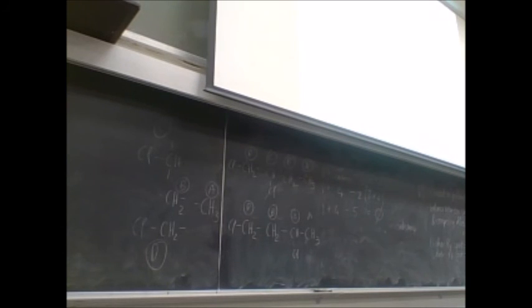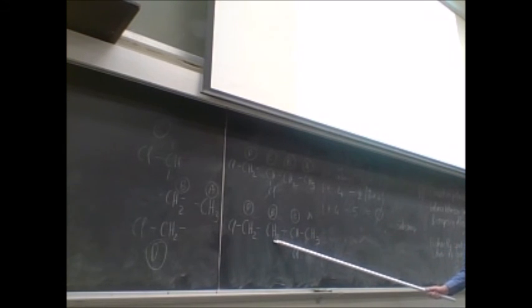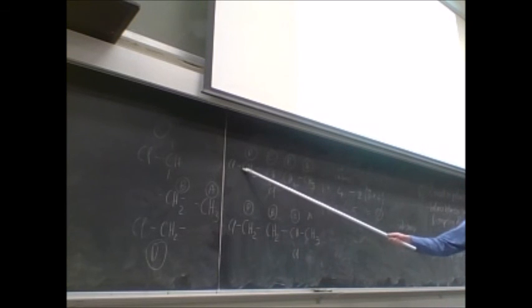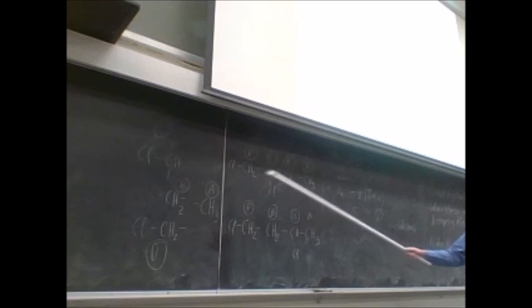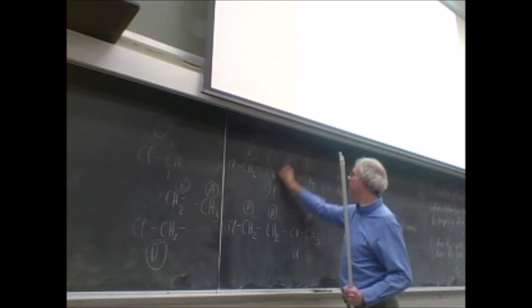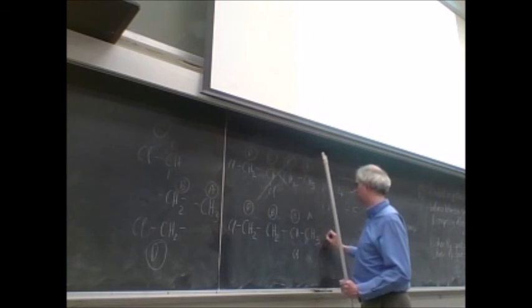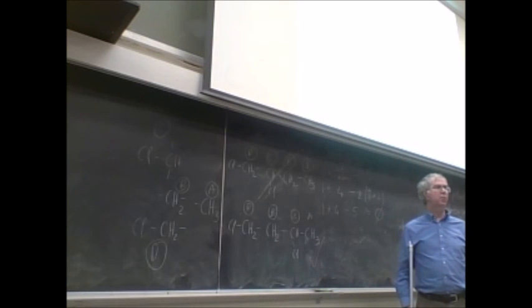That's telling us the CH2Cl has 2 neighbors. It's next to a CH2. This one has 2 neighbors, so it fits. This one would be a doublet. So this peak would be a doublet, not a triplet. So therefore, we can say this one is wrong, and this one is correct. So that's 1,3-dichlorobutane.